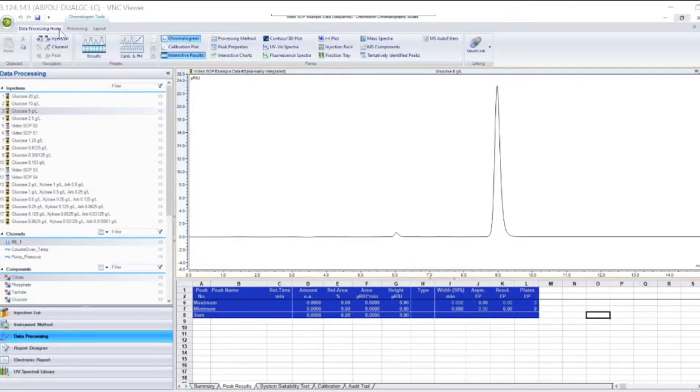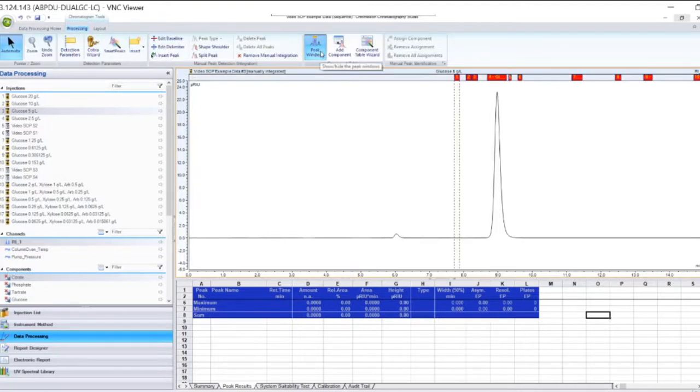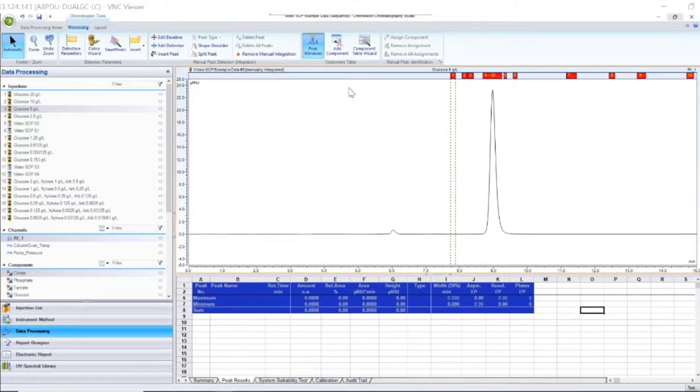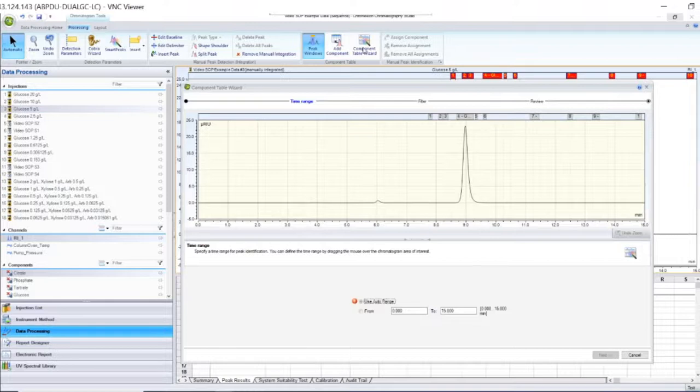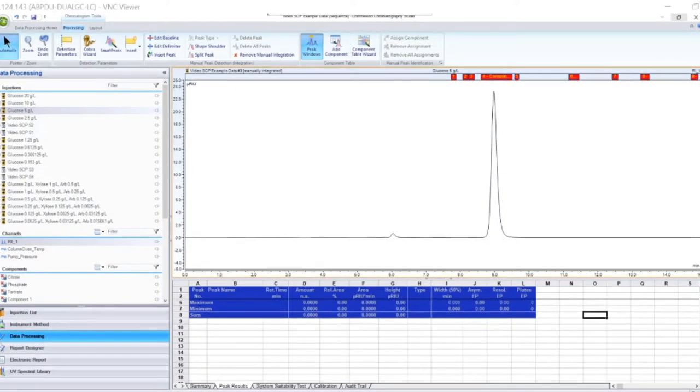For peak identification, navigate to the Data Processing tab and under the Chromatogram Tools, select the Peak Windows option. Select the component table wizard and follow the prompts to identify the time range and peak filtering. You can enter component names in the table at the review stage or add them individually. You can assign individual peaks by selecting Add Component and drawing a rectangle around the peak you wish to add to the component table. Double-click the peak window and edit the component name.